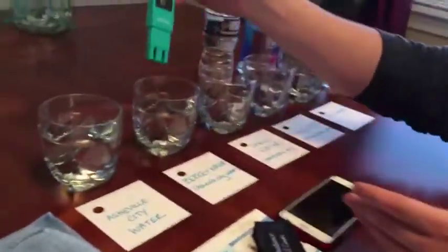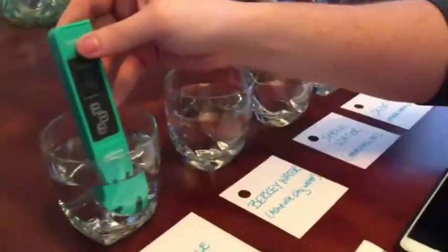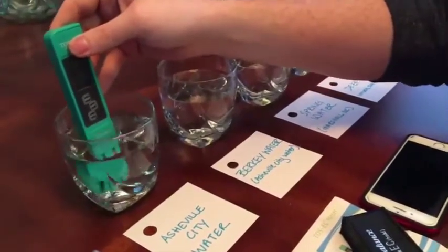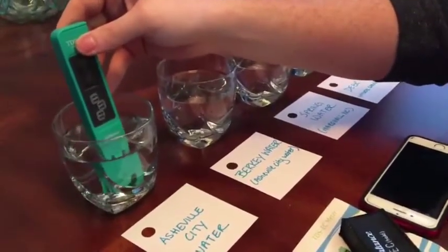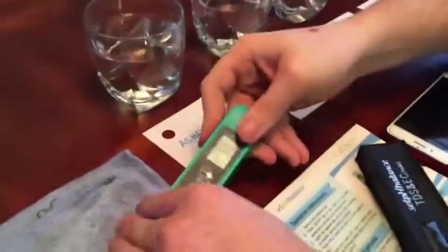A really great practical example: we have fish, and fish are extremely sensitive to dissolved solids. We can't use the city water for the fish even after we dechlorinate it — that tells us it's just not a good water source for them. Using the spring water gives us a much better source, which shows this tool is essential across many different industries.